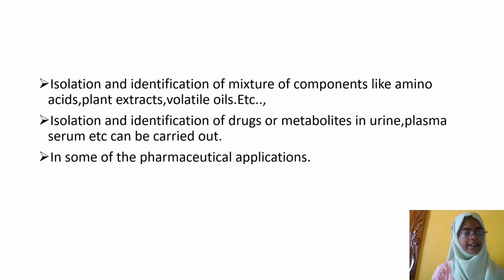Isolation and identification of mixtures of components like amino acids, plant extracts, volatile oils, etc. In amino acids, there is a mixture of components, so we can use gas chromatography to determine the components which are there. In plant extracts, we determine the purity and impurities, and also for volatile oils, etc.